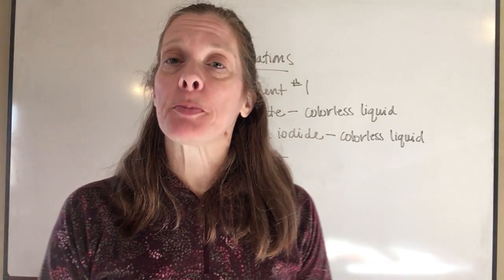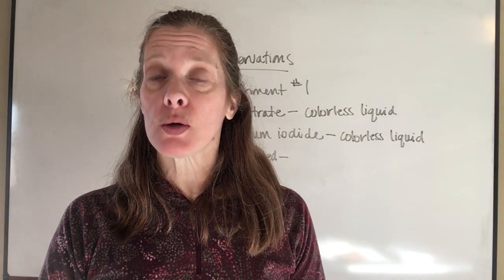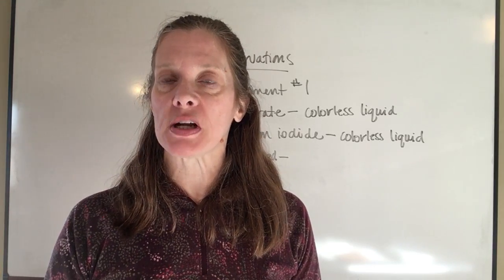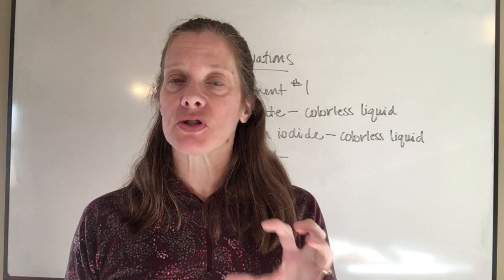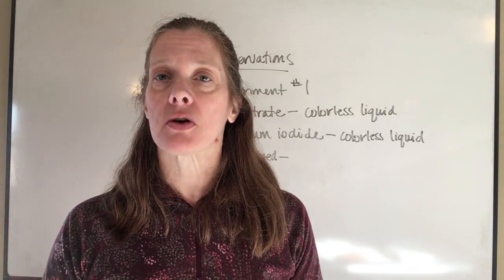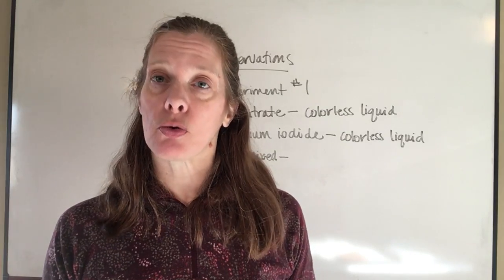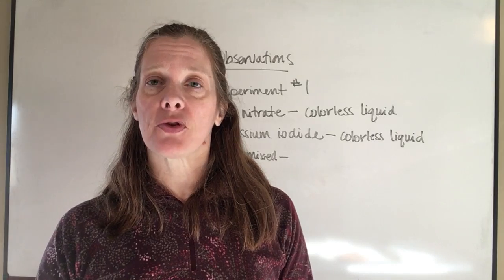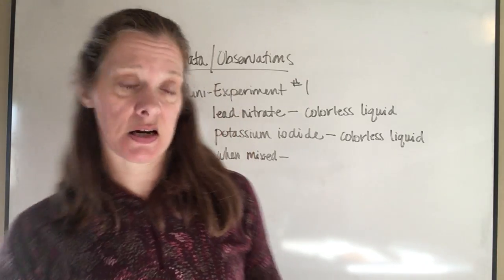Alrighty, today you're going to be performing experiment 7.1 where you're going to be doing several different chemical reactions and observing, looking for the 5 different types of signs that we talked about in yesterday's video as far as what signs of a chemical reaction are. So when you have your lab notebook set up for this is what I want to see.